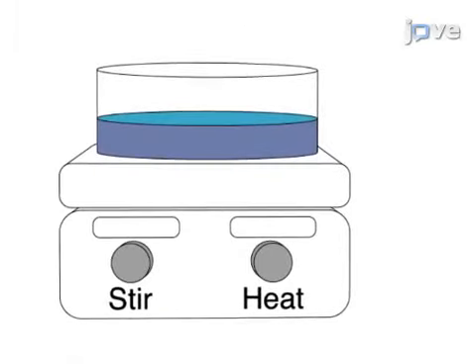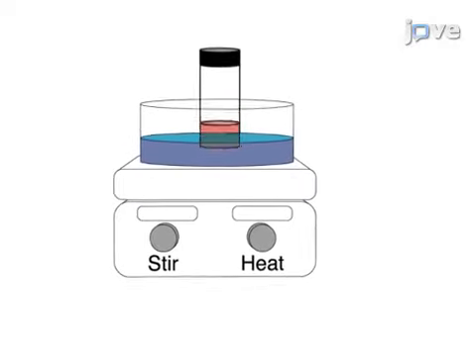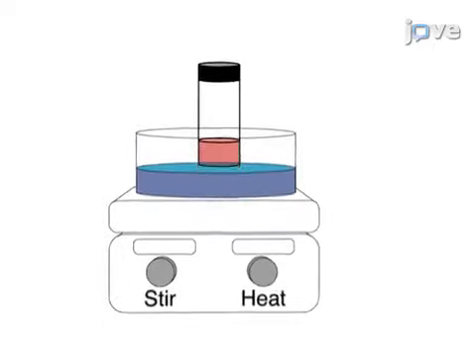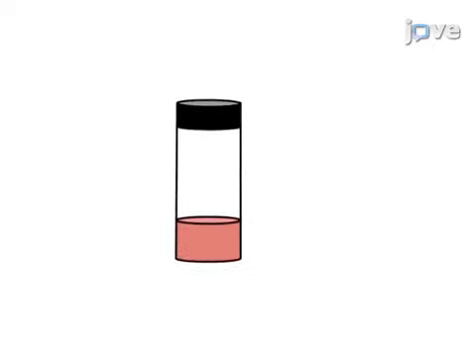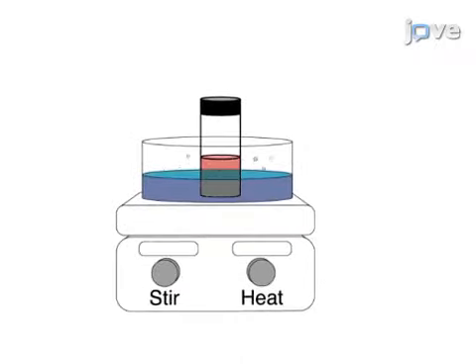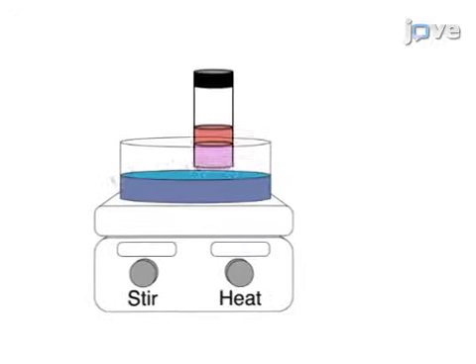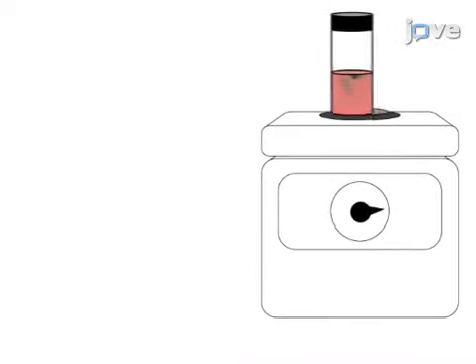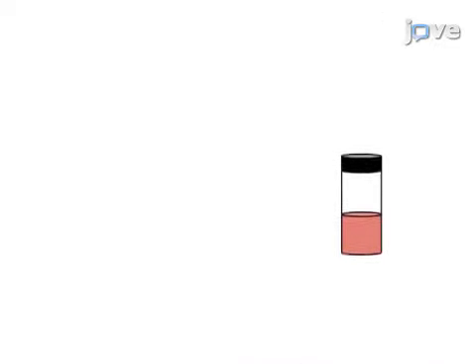This is accomplished by first using the phase inversion temperature method to synthesize the lipid nanoparticles. During this process, the lipid and surfactant are initially co-melted. After adding a specific amount of water, the mixture is heated until phase separation occurs. The mixture is then stirred continuously until a nanoemulsion is created and the synthesis of solid lipid nanoparticles, or SLNs, is complete.